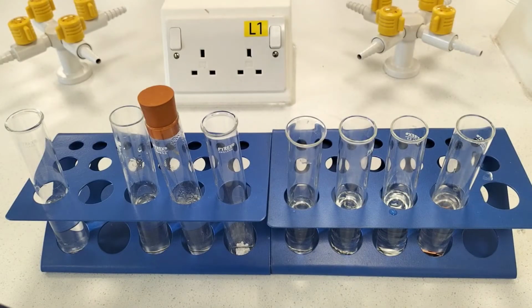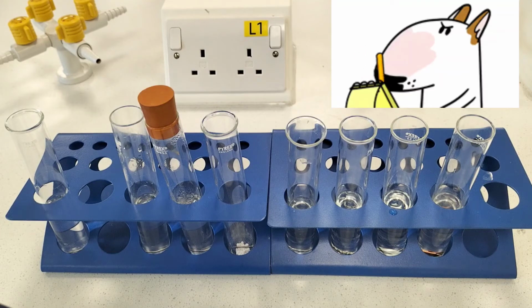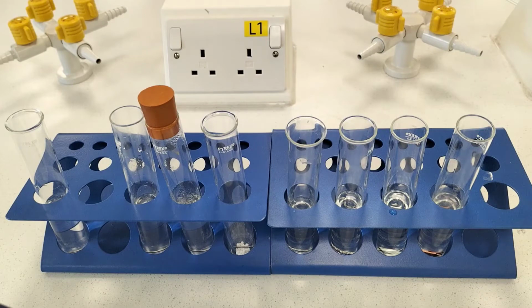So, just before we leave this experiment for a week to do its thing, you might want to grab a pencil and pen and write down some predictions of the extent of rusting you expect to see in each of these mini boiling tube experiments when we come back after that week of time. And then when we reveal the results, you can see how close you got to the reality of the extent and rate of rusting in each of these micro experimental situations.